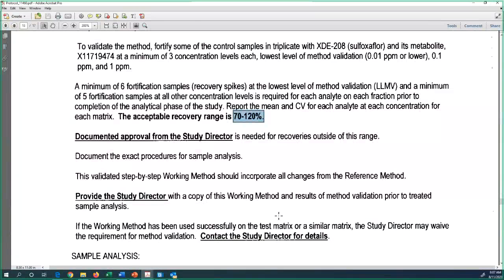So the ionization may not be that great. Most likely this will be ion suppression. You will not get 100% ionization on the sample itself. So I will say 90% chance the matrix effect is going down.